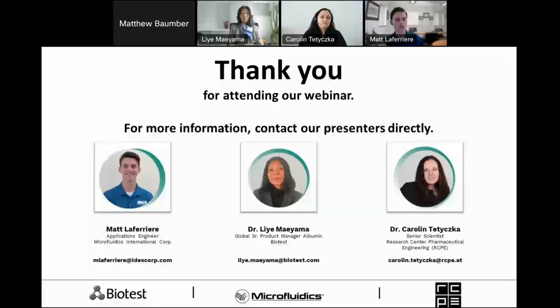Thank you. And we have one more clarification question from earlier. Relating to the release question, could you explain the in vivo process a little bit and also how the encapsulation efficiency was measured? Regarding in vivo, as far as I know, it's active transport inside the cell, but maybe we can answer this question later on. And regarding encapsulation efficiency, we used special filters, centrifuged our suspension, then used the aqueous phase for quantification via HPLC, and then determined the encapsulation efficiency.